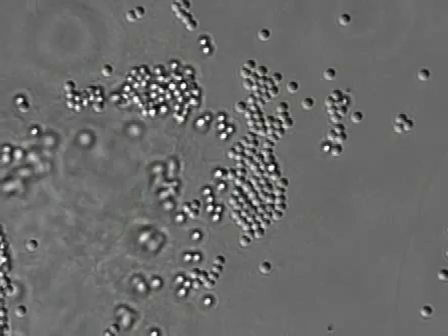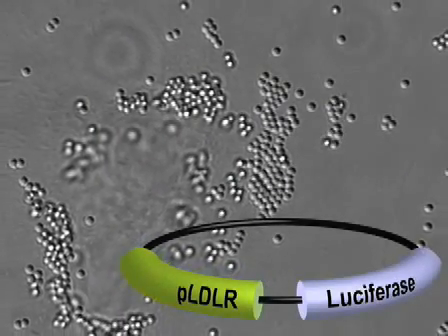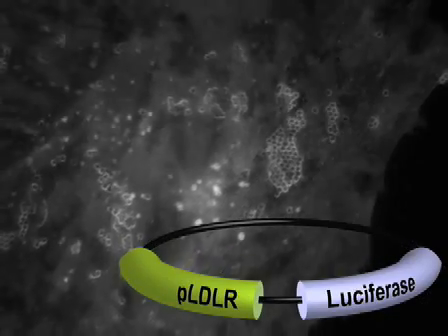Hi, I'm Xiaochong Zhang from the Laboratory of Axel Nothoff in the Department of Molecular and Cellular Biology at Harvard University. Today, I will show you how to use the reporter gene assay to analyze the regulation of genes involved in membrane biogenesis after phagocytosis. So let's get started.